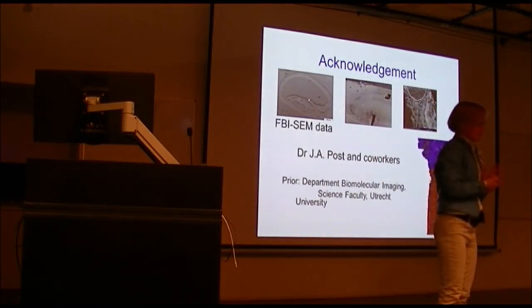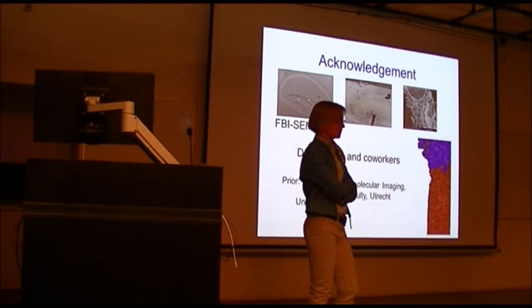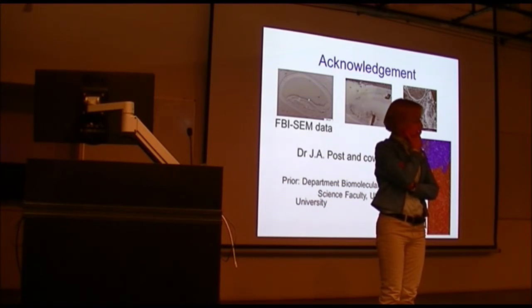I have a history of science question, because you didn't mention when electron microscopy started to be used. And my second one is about how what exists in our tissues was deceived. So what was one of the first shocking discoveries after we had the electron microscope? The first electron microscope was, I think, in the 1940s, in Germany. Okay. So around that time, what was the most exciting? That's a hard one. It doesn't have to be, I'm just curious.